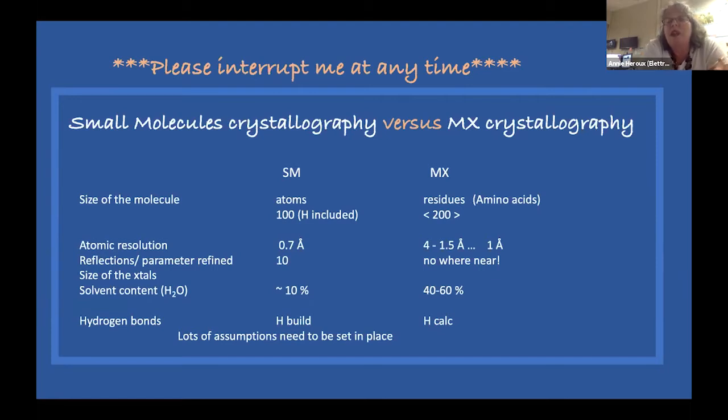So we already make an assumption there, because alanine, for example, already has a subset of atoms included in the residue. A small molecule, which is actually kind of big, can have 100 atoms, but for a protein, you can have thousands of atoms.